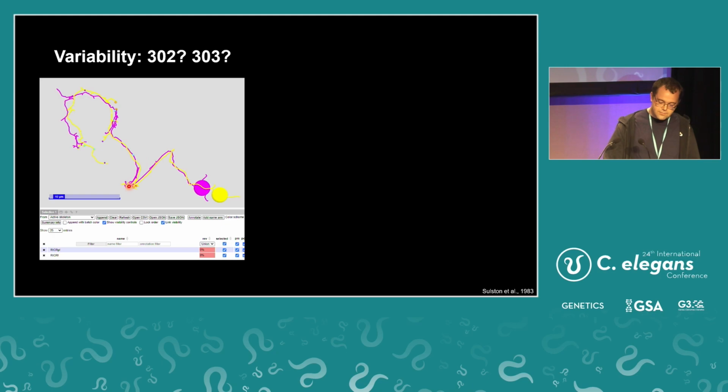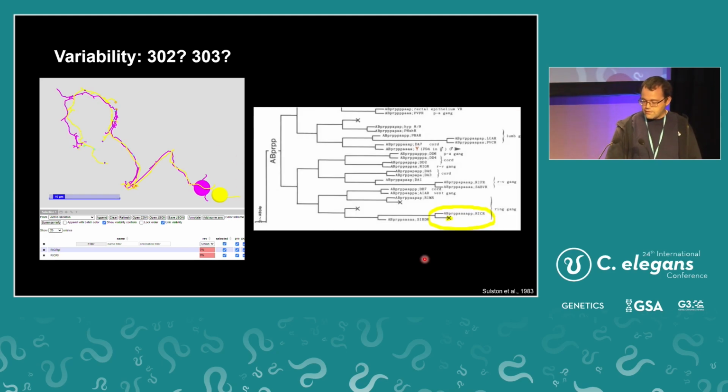They sent these processes going in the same area and making the same connections. But it turned out that RICR has a sister cell that's supposed to undergo apoptosis. And it looks like in this case it just simply didn't. And it took on RICR fate. So we've seen this a couple of times in our EM volumes.